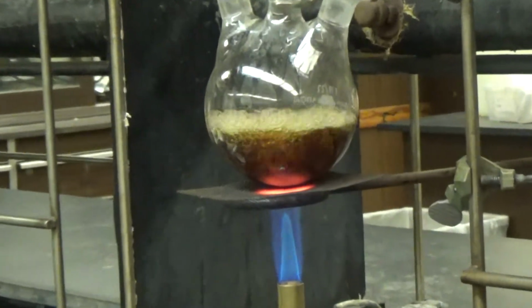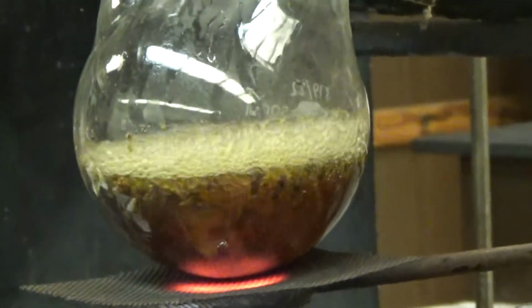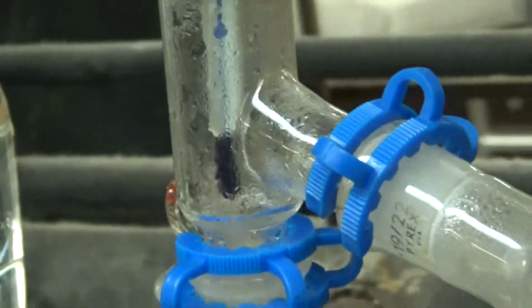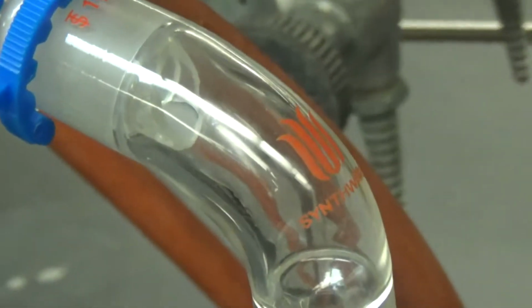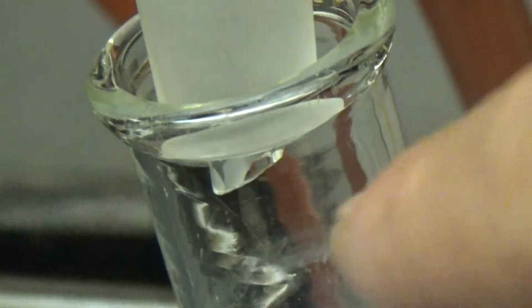All right. A couple of minutes later, it's got a nice, intense boil, and the vapors are coming up. You can actually see that the vapors are reaching up to the thermometer adapter. And we're starting to see the water and clove materials drip out, so we're capturing the product there. You see it's starting to come? See some drips. Good.